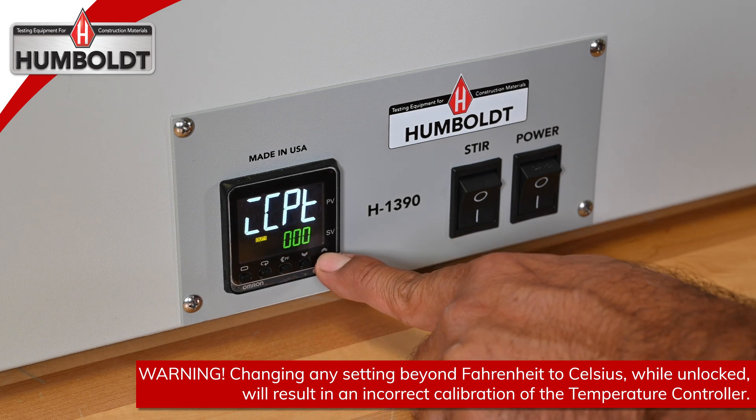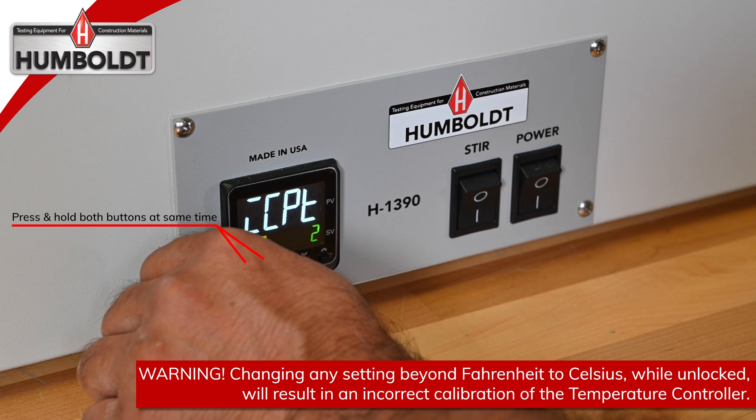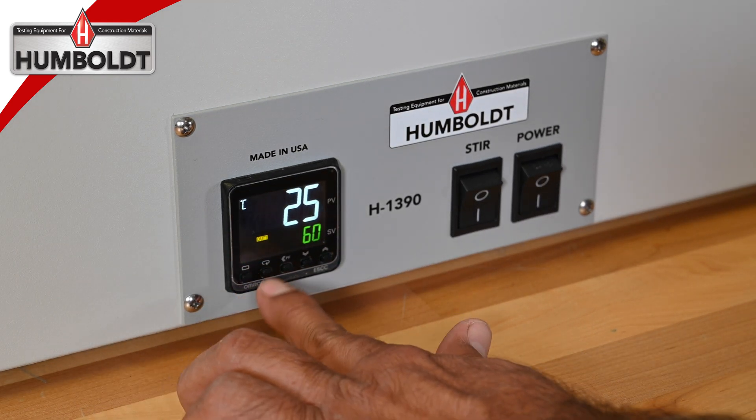Using the up arrow, change the 0 to 2. Press and hold the first two buttons on the left at the same time for 3 seconds. Your controller is now locked and ready to use.